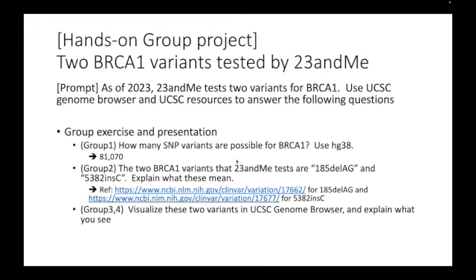But what about NGS? What is the typical error rate at the end when you do all the downstream process? Around 10 to the minus 5 or 10 to the minus 7. That is the final value when you align it with the mapping and proper control, and then when you finish. But for the SNP chip, you cannot get better than that. But in NGS, eventually you reach that state for the variant quality.